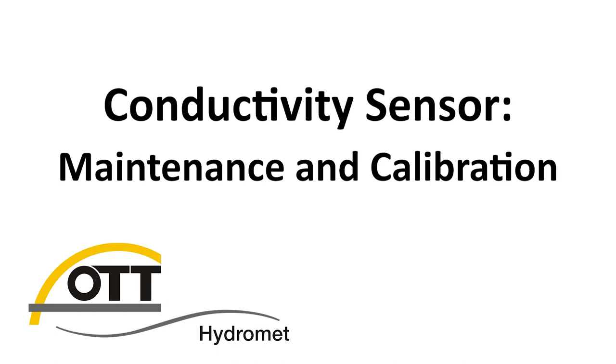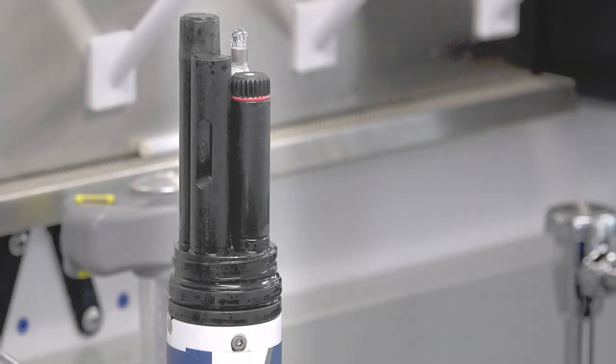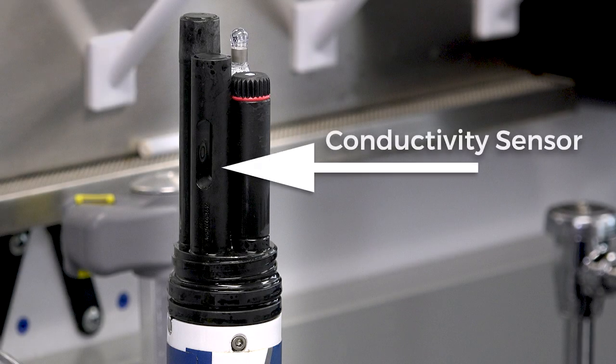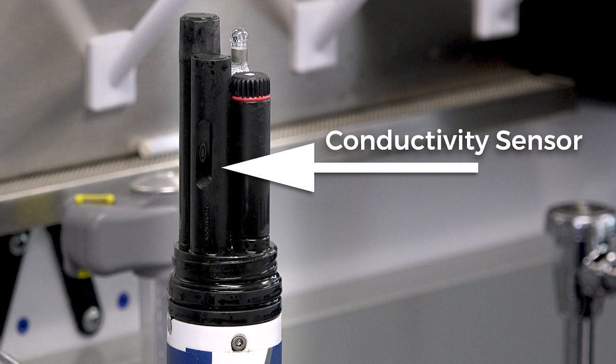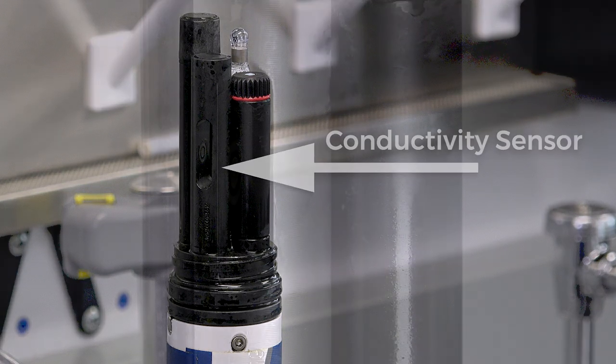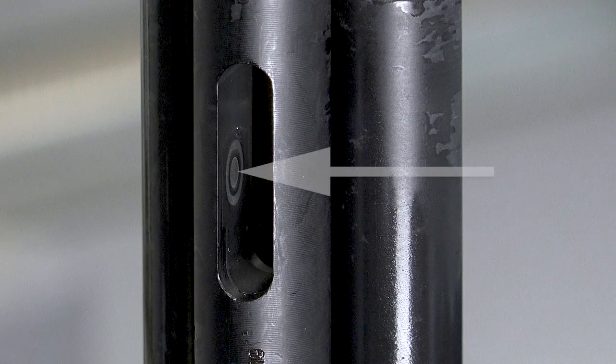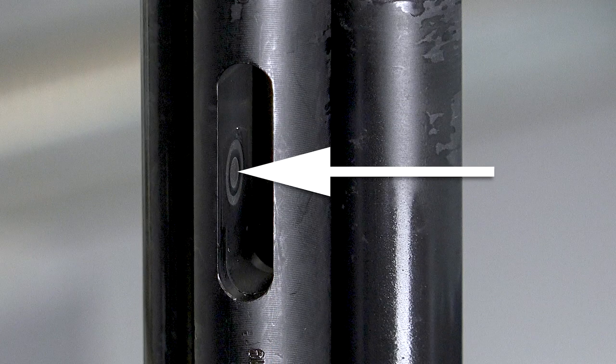Maintenance and calibration of the conductivity sensor. The conductivity sensor measures the ability of water to conduct electricity across a set distance between graphite conductors of a known size. When the conductivity is known, the salinity and total dissolved solids can be calculated and displayed.